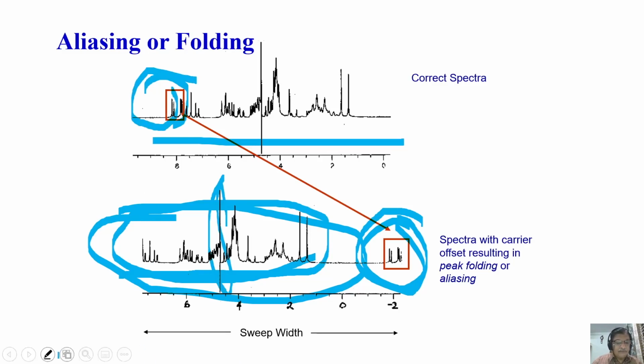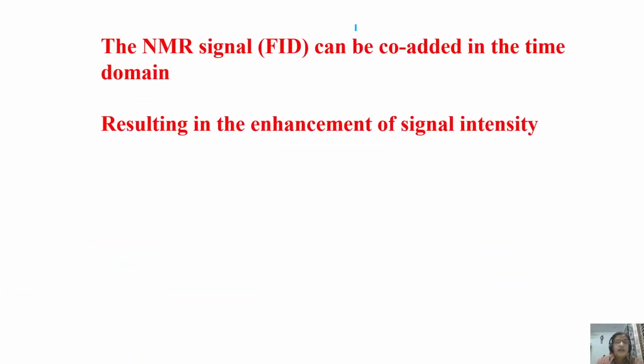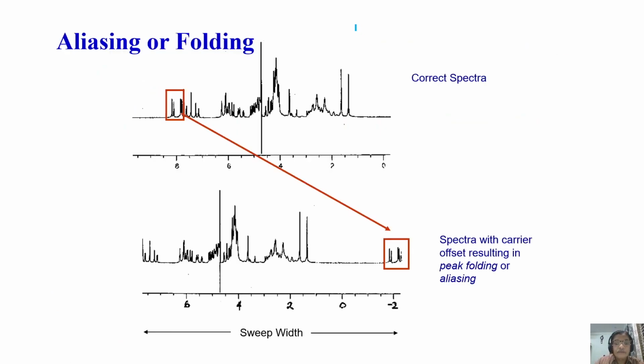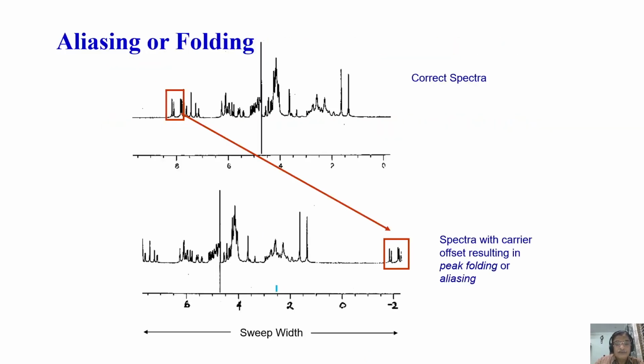You understand? So that's what happens. Now, I said sitting here and I'm covering here, this is folded here, or sitting here covering this much, this gets folded here. Either way is correct.